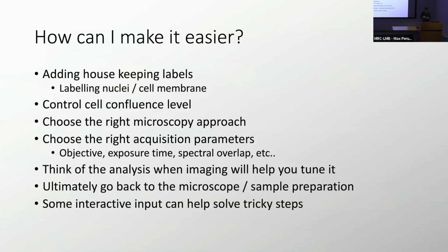And then the last thing which can make it easier: sometimes an analysis task looks very difficult. You can't solve one little problem. At one step in the workflow, there is something very difficult and you don't manage to find a tool to do it. Actually, just doing it with a bit of interactive input will solve the problem, and then you can move on.